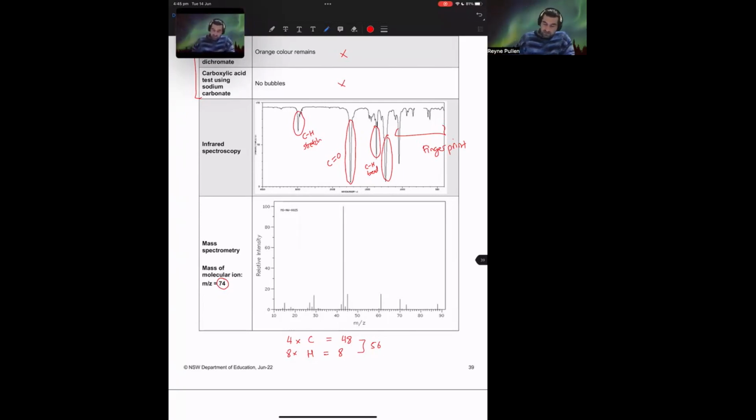out. And if we consult our table earlier in the document, you'll find that this relates to a single bond carbon oxygen, which is interesting because this is suggesting then that there is both a carbon double bond oxygen and a carbon single bond oxygen signal for this structure. That would rule out a ketone, unless maybe you had a bridging carbon further along the chain sort of thing.